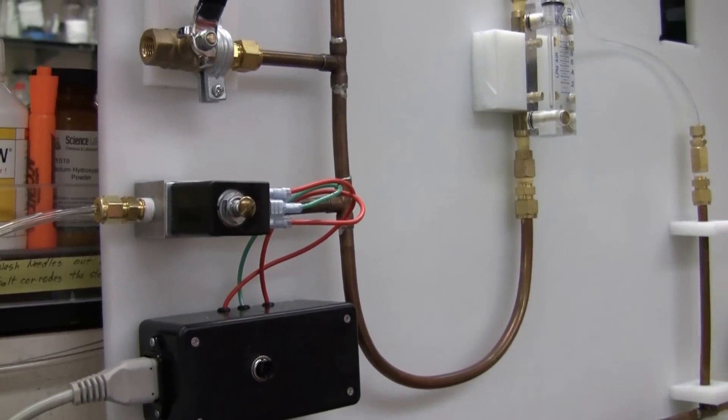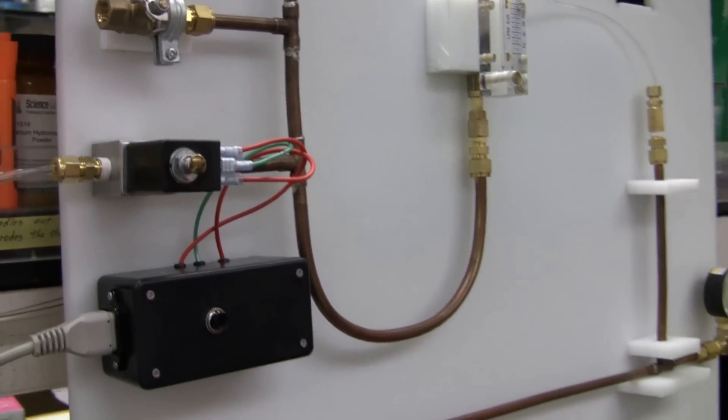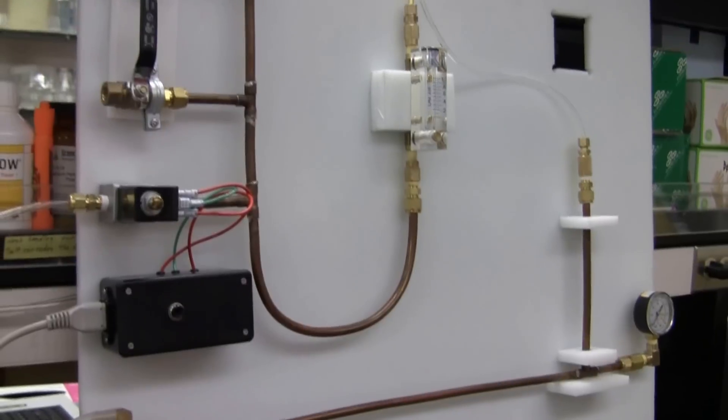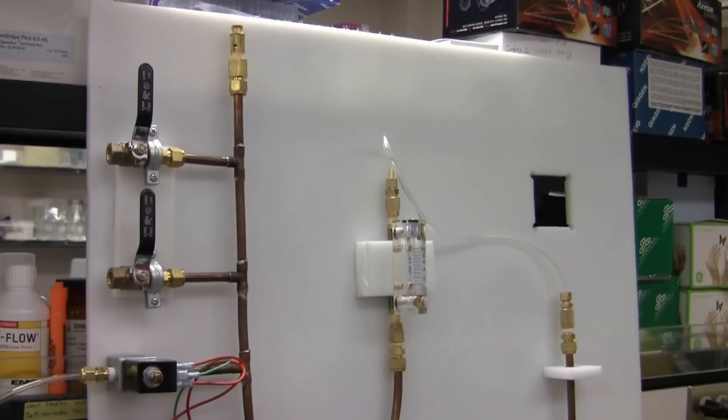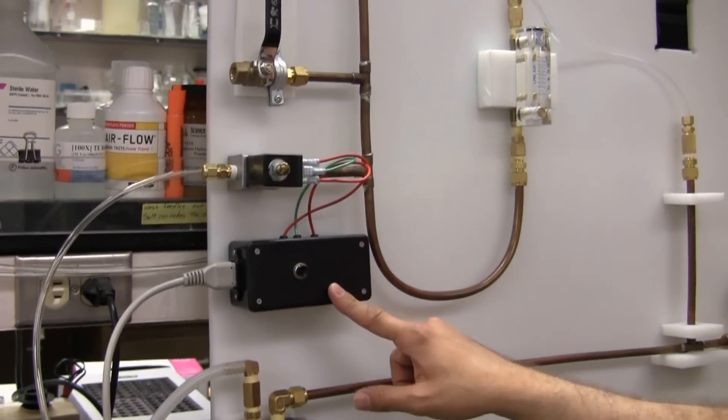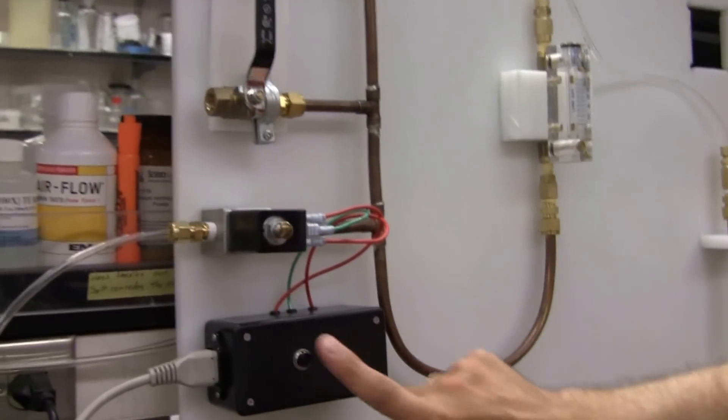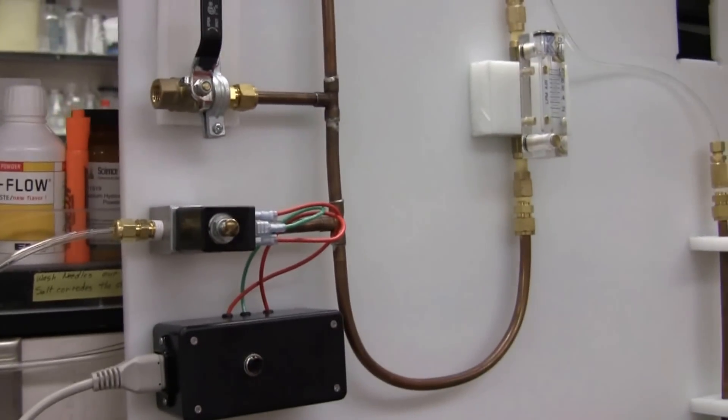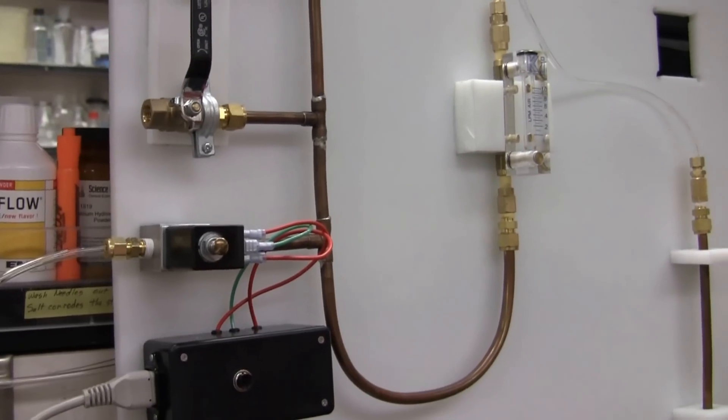Of course, we definitely recommend that you always turn off your flammable gases and use all possible precautions, but still in case, there is a dead man switch, which will have to be manually reactivated after 25 minutes by pressing the button.